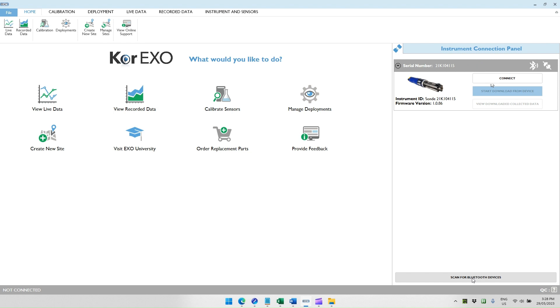If your sonde doesn't appear, make sure that your Bluetooth adapter on your computer is on and that the blue light is flashing on the EXO sonde. If the blue light is not flashing, you may need to use a magnet to wake up the Bluetooth connection, or you may remove and apply power so that the Bluetooth is reactivated on power-up.